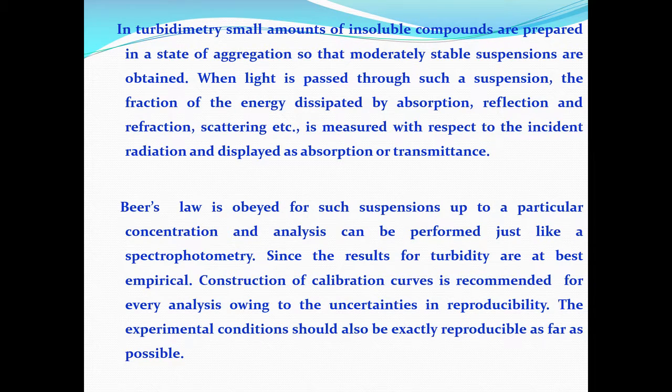Next day again you come and do the calibration, do the measurement. Even if the reagents are all the same, the absorbance will be different.